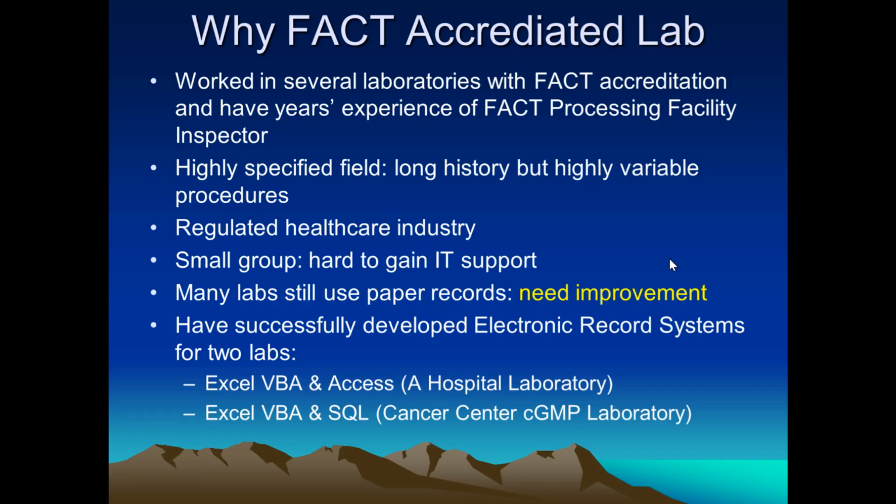Also, because this is the healthcare industry, it's strictly regulated. You have to meet some criteria, and maybe also involve FDA regulation if you're working in a CGMP environment.